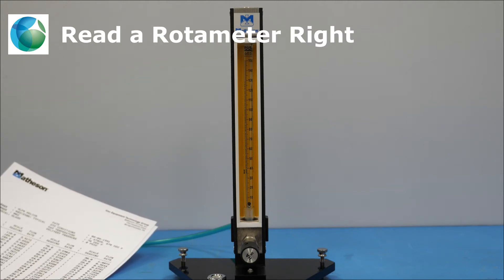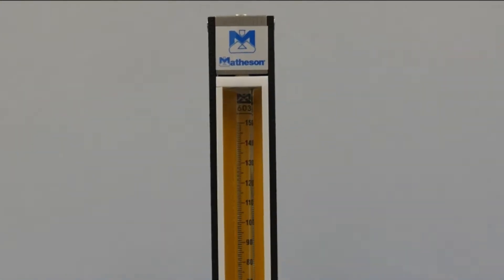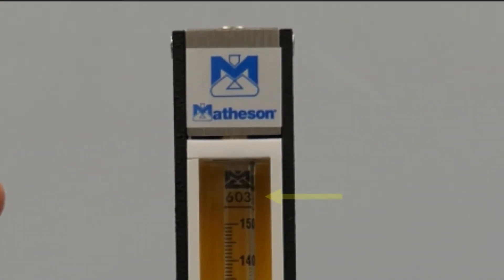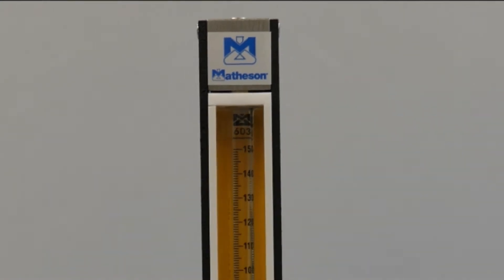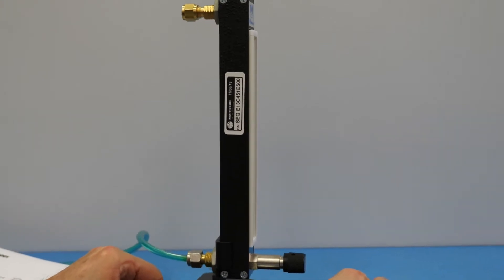Hello, in this video I'd like to demonstrate for you how to operate and read an FM 1050 series rotometer. In this case we have a 603 tube in the meter which corresponds with E500 and its part number.